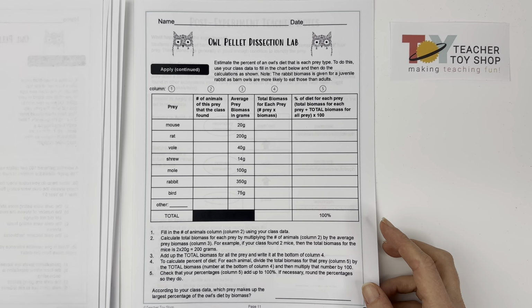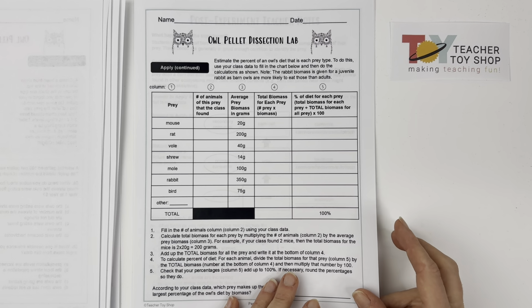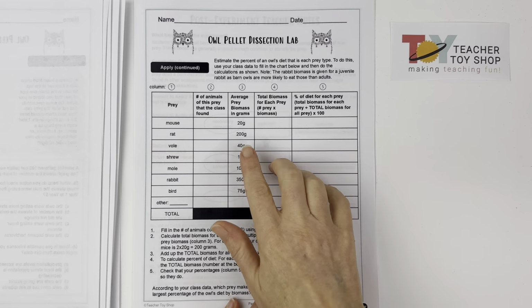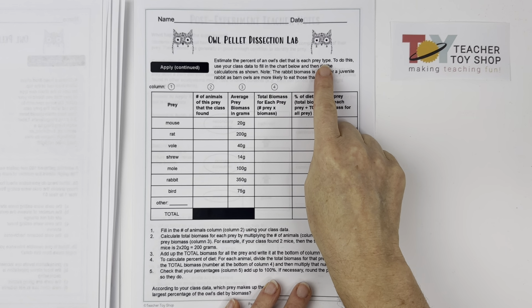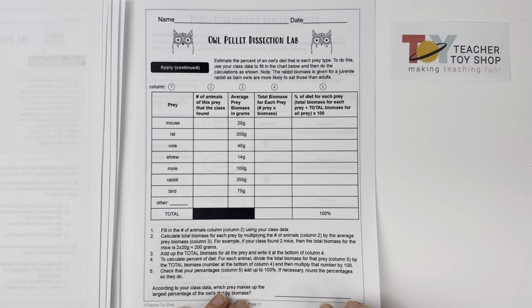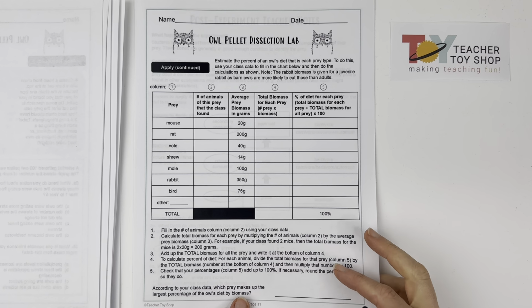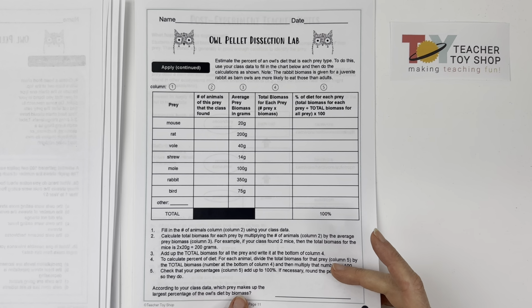If your students are a little bit more advanced, you can use this application question, which has students estimate the percent of an owl's diet by biomass. So the students figure out which prey makes up the largest percentage of the owl's diet by biomass. This is intentionally at the end so that you can leave it off if your students are not ready to calculate percentages yet.